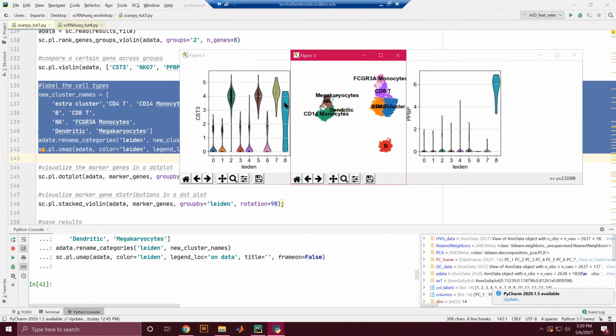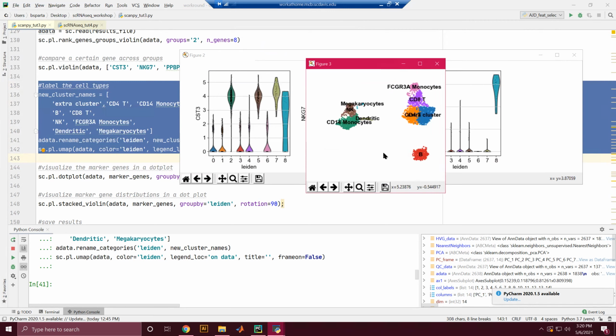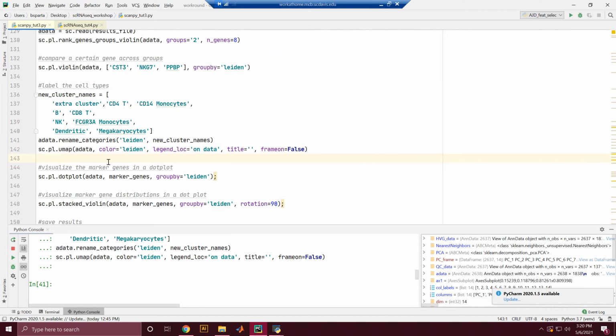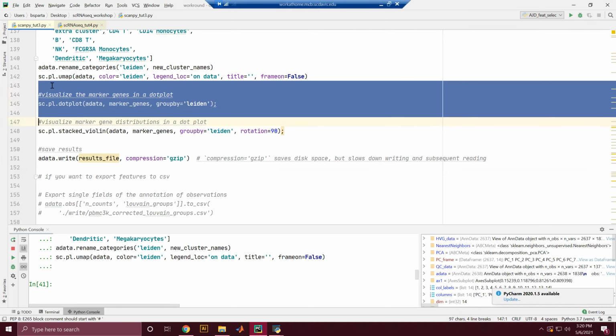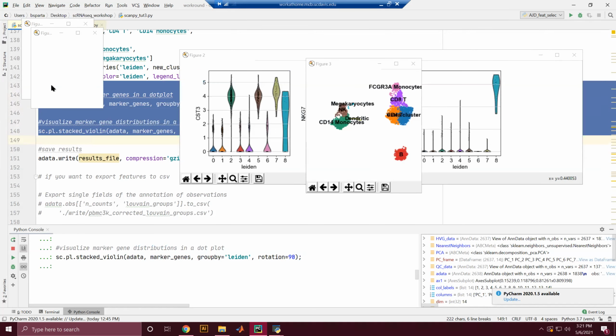And we can also plot those labels directly on this UMAP that appears to be lacking axes. And there's a lot of different ways to visualize these differential expression patterns. You can use heat maps, you can use these kernel density estimators, which are the violin plots, or box plots if you prefer. There's a whole tutorial on the ScanPy website of different ways of data visualization for differential gene expression. Here I'll just show you two more before we go on to a more experimental tutorial.